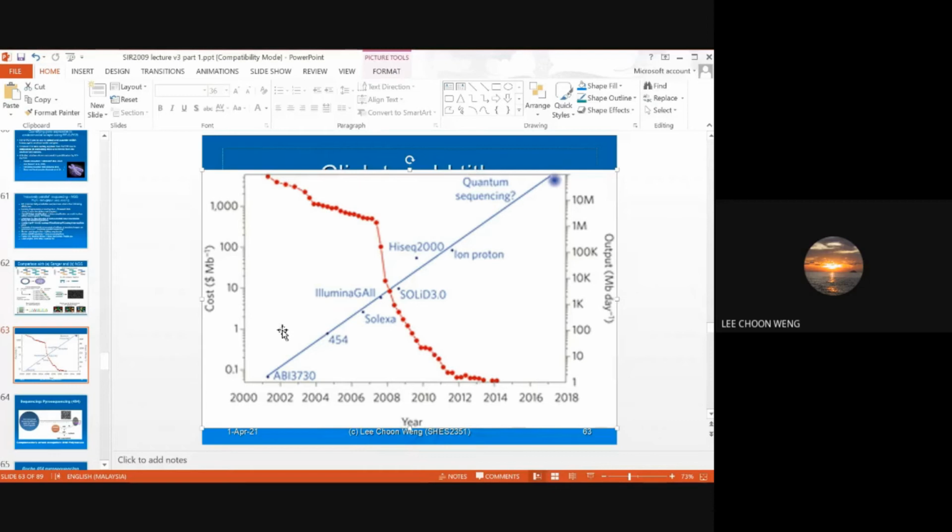So there is also possible rubbish being produced alongside all those sequences. As a scientist, you have to be very careful. You have to be able to separate out what is data and what is not, what can be used and what cannot be used.